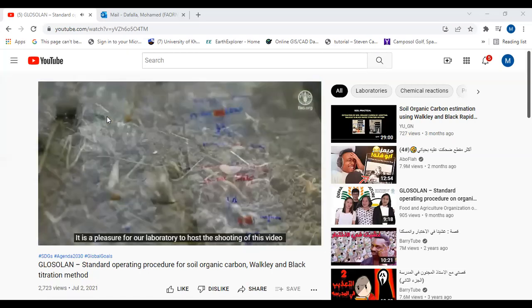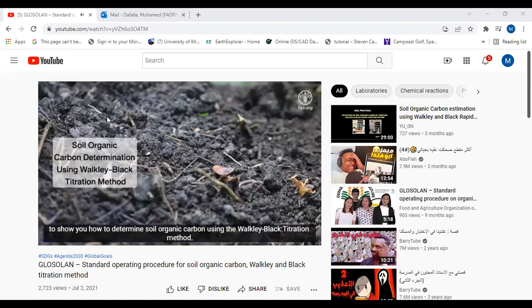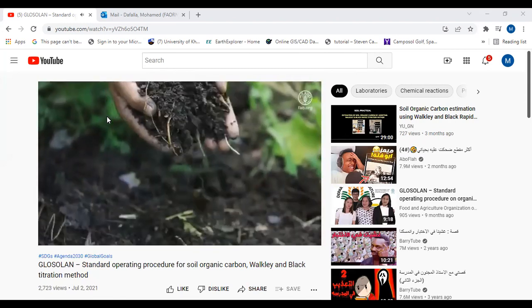It is a pleasure for our laboratory to host the filming of this video to show you how to determine soil organic carbon using the Walkley and Black titration method. Organic carbon is one of the most important soil parameters.